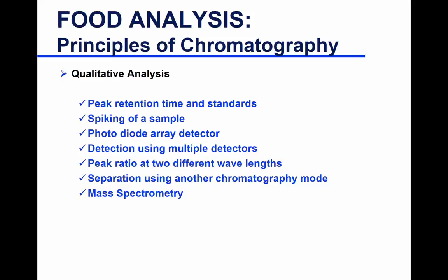And then with a photodiode array detector, depending on which lamp you're using, if you're using a deuterium lamp, you can monitor UV from 200 to 400 nanometer. Every split of a second, so I think it's a very small fraction of a second, you get a spectra. This is your lambda max. So in the case of caffeine, this was 272 nanometer.